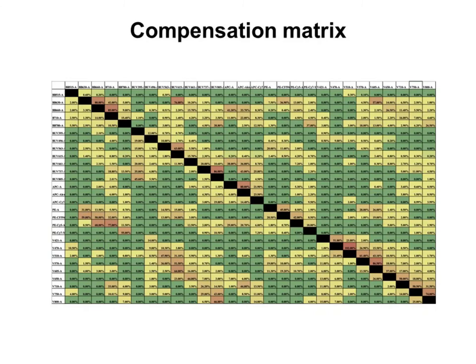Of course, we are used to seeing how the compensation is. I've shown you in the previous slide the spillover spreading matrix, and that was acceptable. Now I'm showing you the compensation matrix, and most of the values here are acceptable, although the absolute value doesn't mean much, it's just to show you don't end up with major problems.